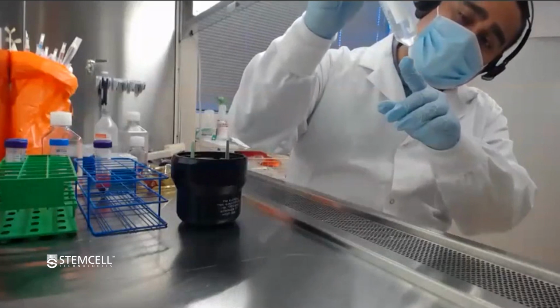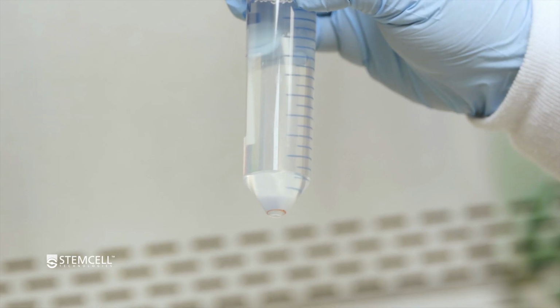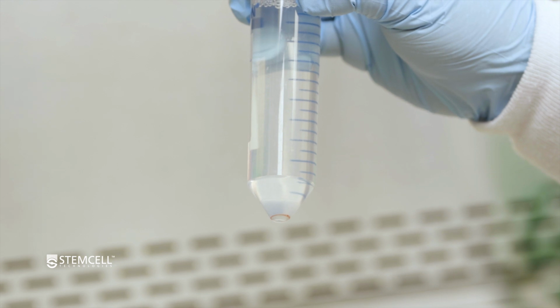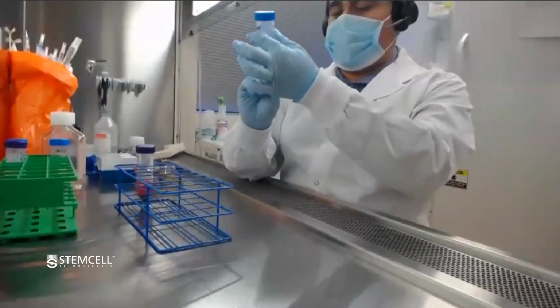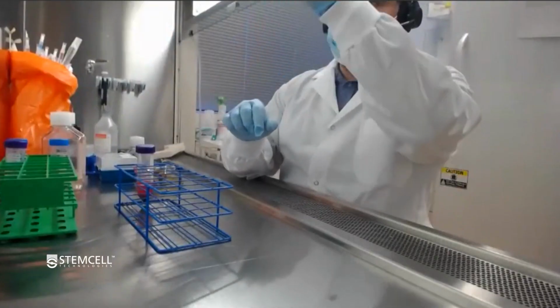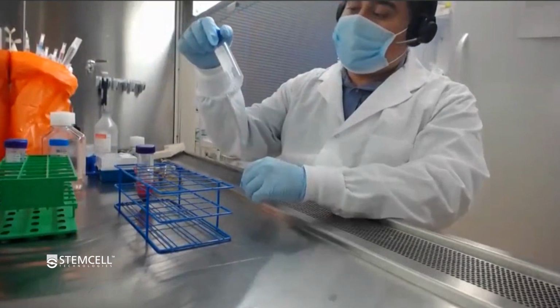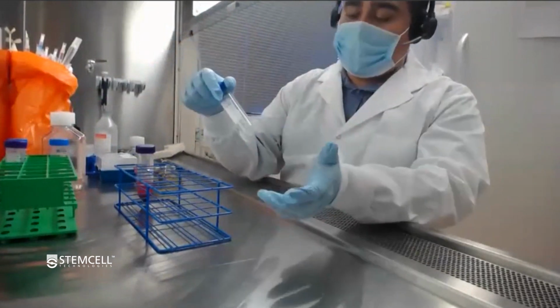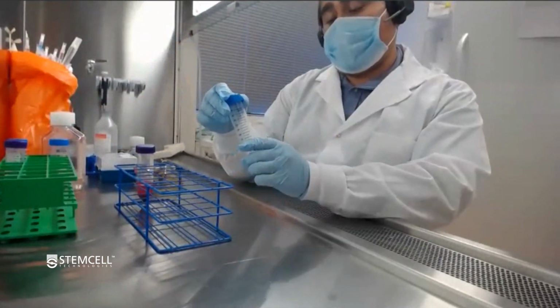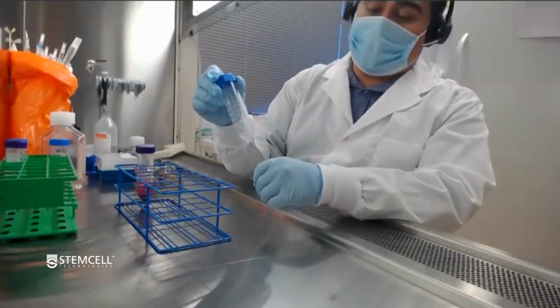Okay, and I just wanted to focus in that red blood cell pellet, or the red cells, are still among the pellet. And then just agitate it to break up the cell pellet. And normally I would add about 1/2 ml to count. Or if you are going to be cryopreserving these, then you would follow your cryopreservation procedure.